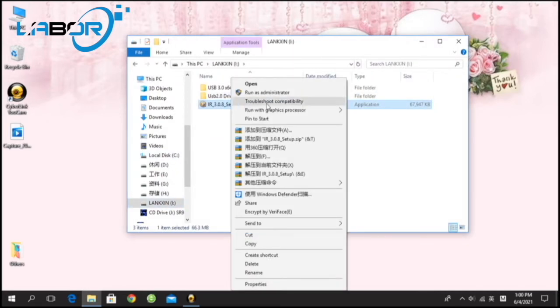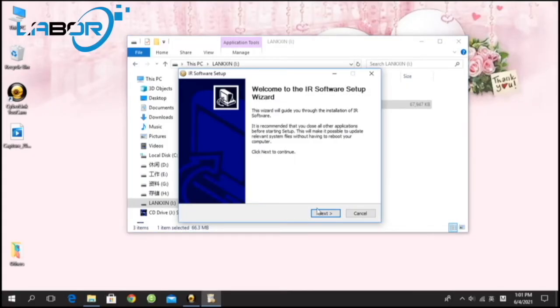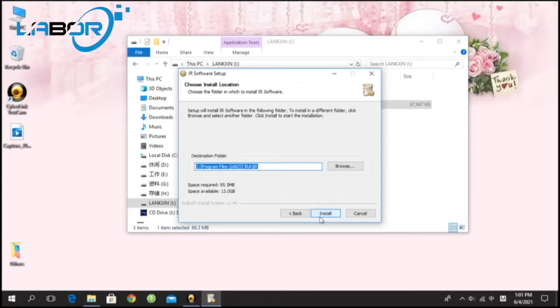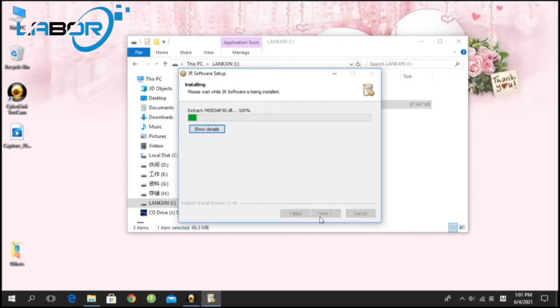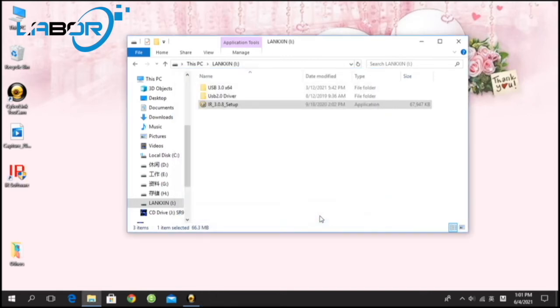It's better to run as Administrator. Okay, software installation finished.